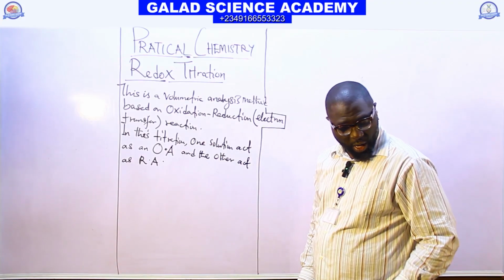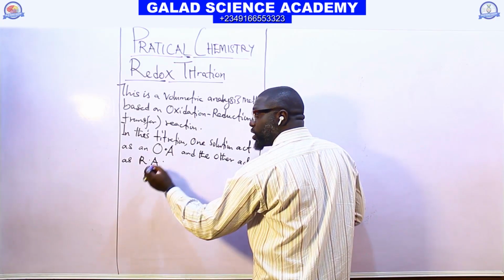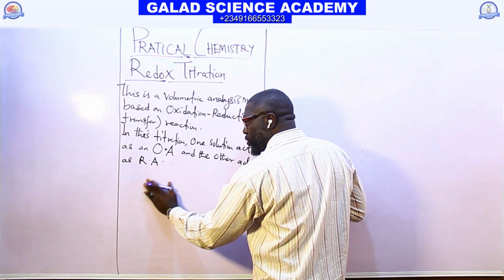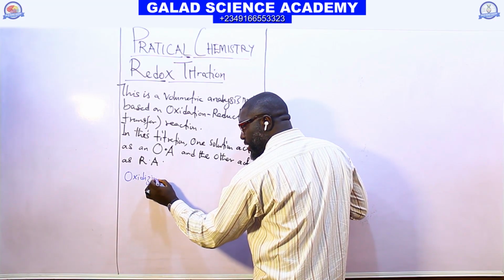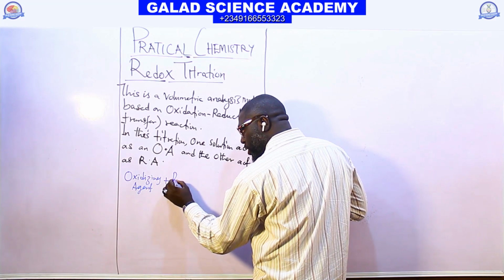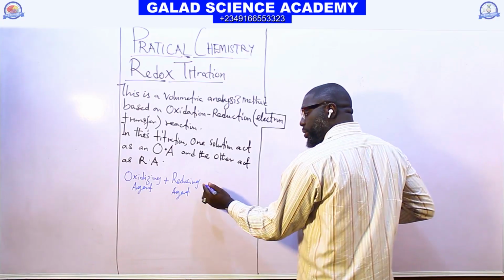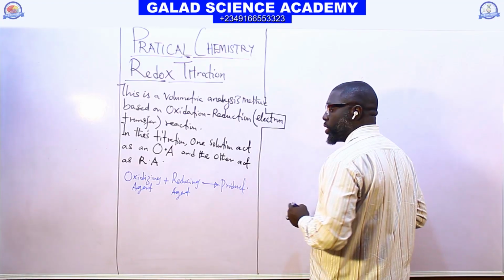That is, we can have oxidizing agent plus reducing agent giving products.